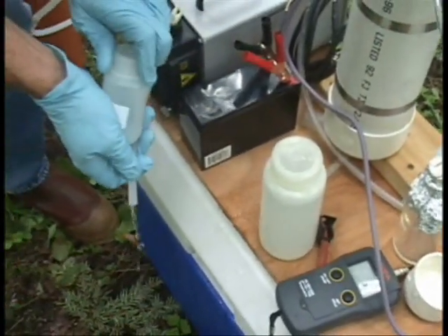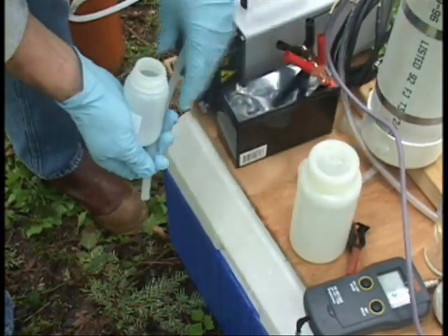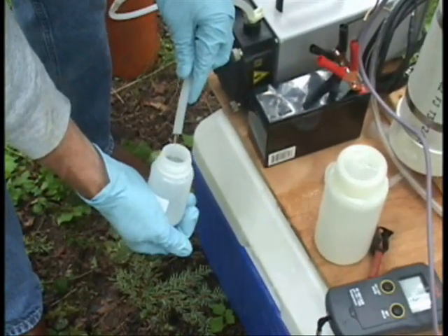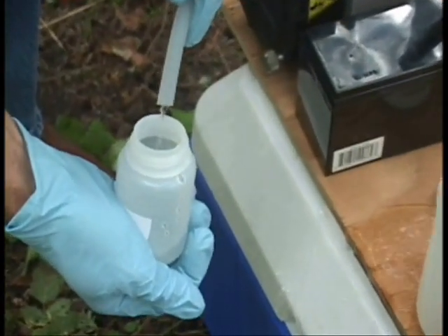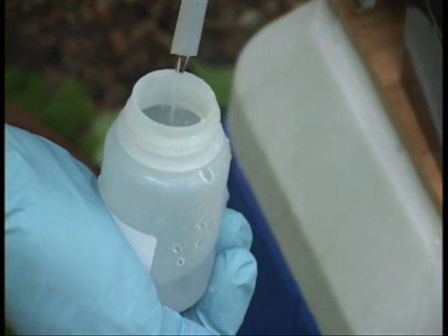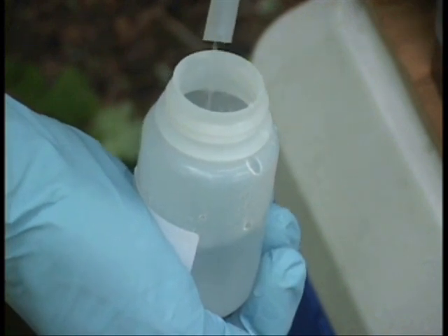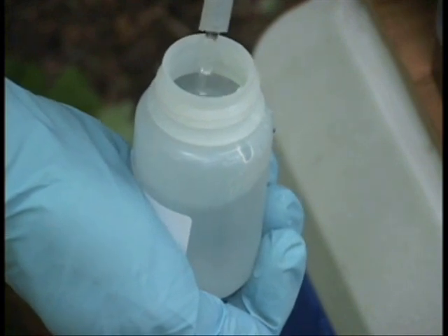Now we'll go ahead and do our nutrient sample. Again, this is one where we don't rinse and we don't overfill. This sample would be for nitrate, nitrite, ammonia, and total Kjeldahl nitrogen.